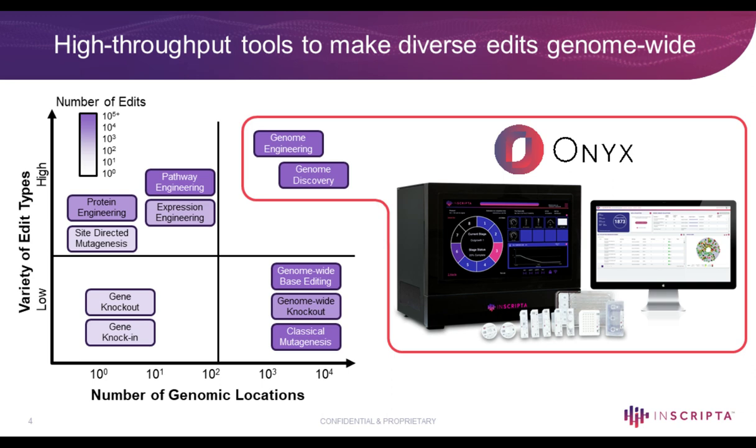Here, because of the software that's being made and the automated aspect of the instruments, combined with the power of barcode tracking, we can actually explore the full potential of genome engineering. So not just in one locus anymore, not just one type of modification, but really anything that you can imagine can be spread out across the genome.